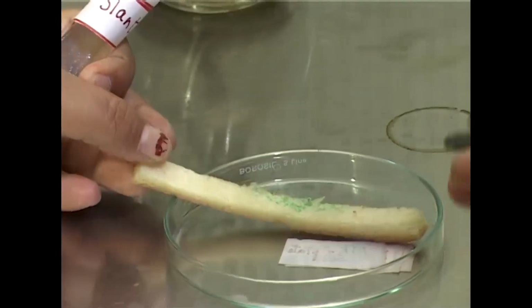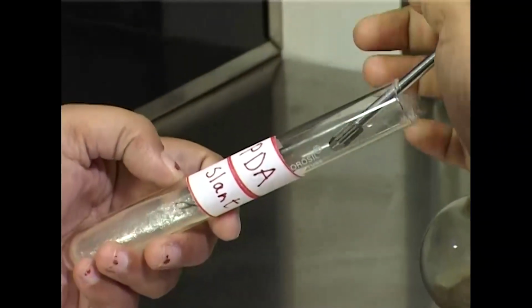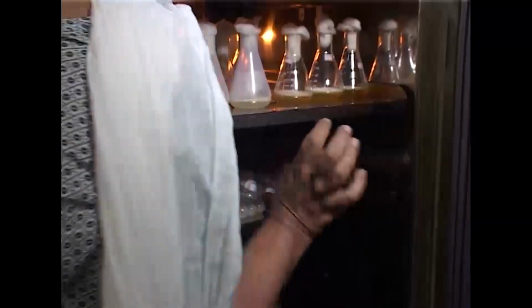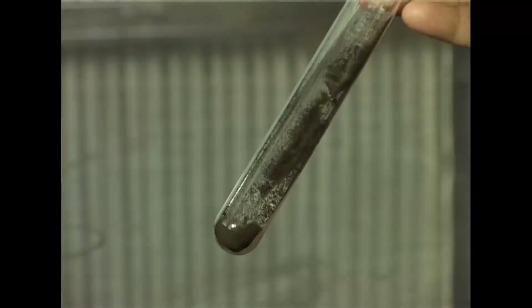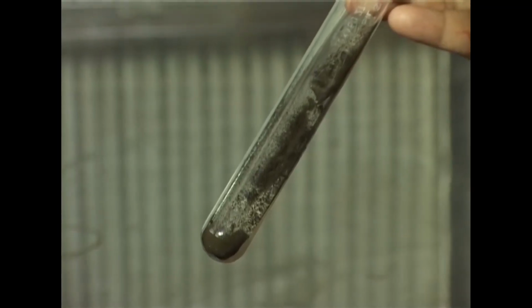A piece of contaminated bread along with the specific colony will be transferred over the PDA slant, and that will be incubated at 30 degrees centigrade overnight. And the colony characteristics again will be followed. The result shows the colony color and the spore characteristics. You can follow the black round conidia that will be observed, that can designate the presence of Aspergillus species, because bread can be frequently contaminated with aerial spores, molds, Aspergillus species.